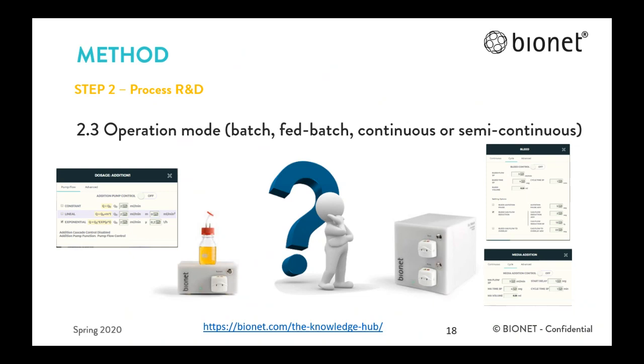The continuous process increases productivity and is cost-effective, with some additional advantages like the control of non-desired substances or toxic compounds produced during the growth. Nevertheless, it's not always possible to establish this mode due to regulatory limitations. Not all products can be produced in the log or exponential phase, which is the main goal of a continuous process, to maintain the culture in this phase. There are also contamination risk, mutations, or technical limitations.